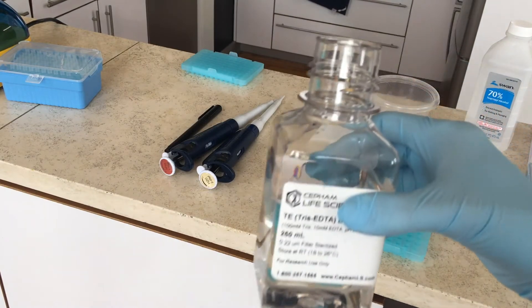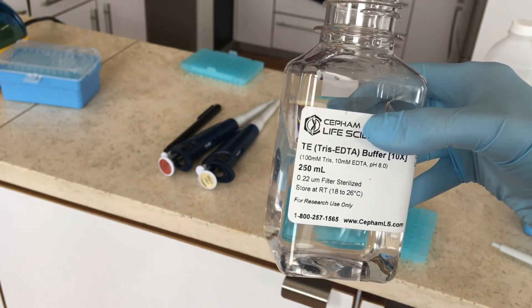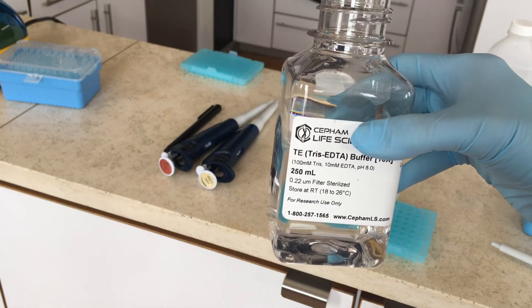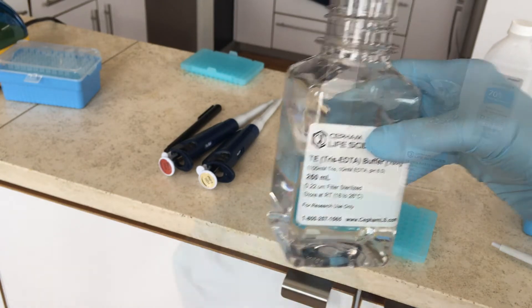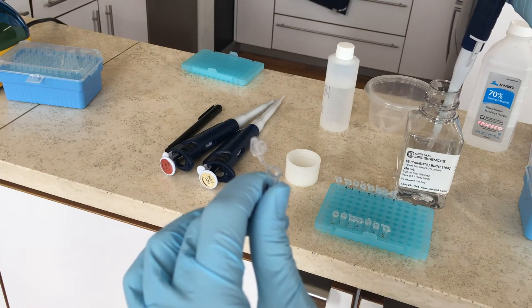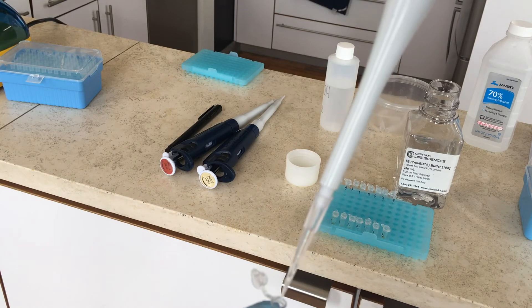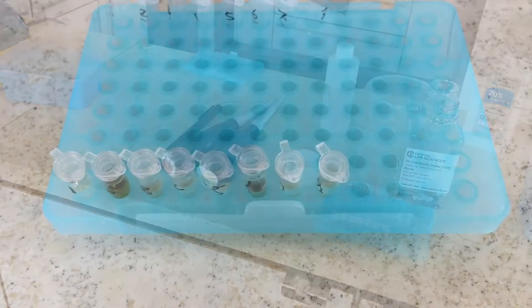When the 10 minutes are over, you're going to add 150 microliters of the Tris-EDTA buffer to each of the tubes. You can use the same pipette tip as long as you don't touch the tubes, so carefully drop it in without touching the tube. Push down on your pipette — not all the way — dip it into the Tris-EDTA buffer, then dispense it into each tube, repeating eight times.